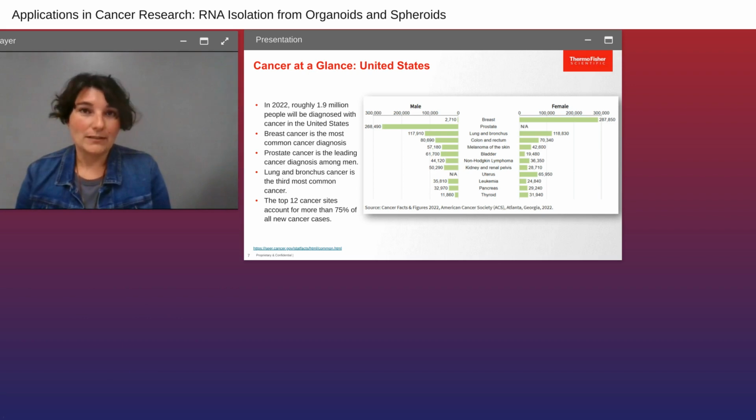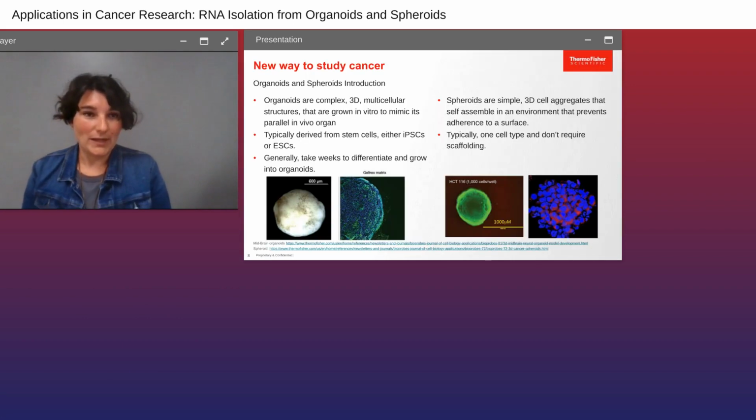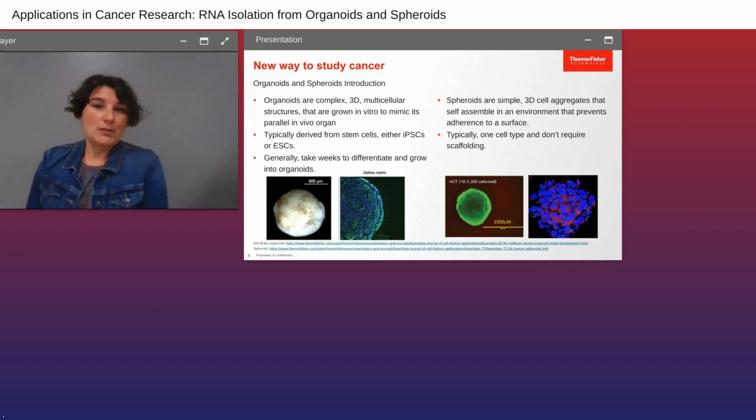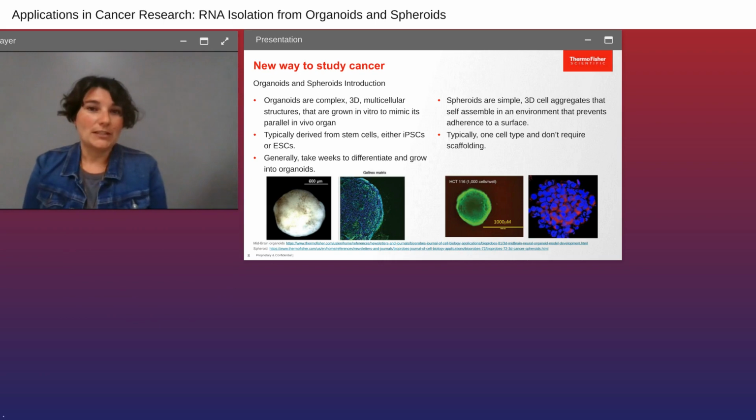And some great links have been made in the research space, and some new ways of researching is using 3D cell culture. Some of you may be familiar with organoids and spheroids, but for those who are not, I wanted to give a brief introduction as to what 3D cell culture is and a definition of what we've been calling spheroids and organoids. There's still a little bit of discussion as to what an organoid or a spheroid actually is, and so this is the way that we've defined what an organoid and spheroid is.